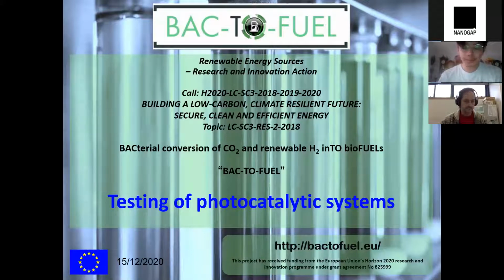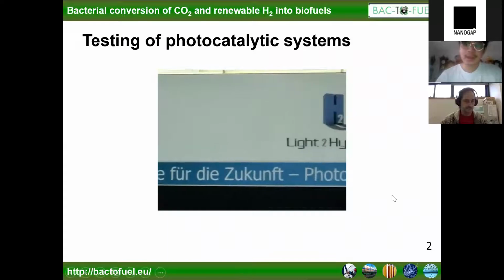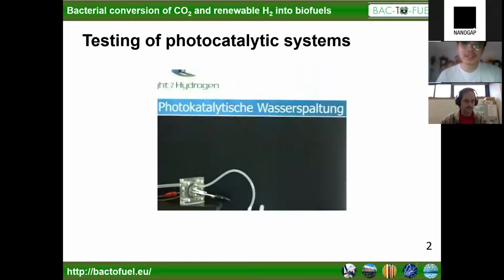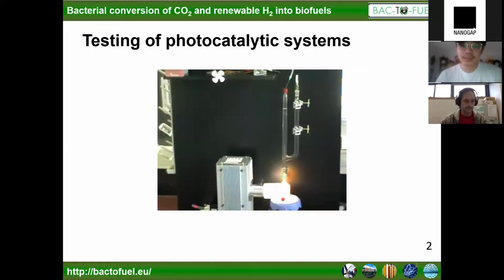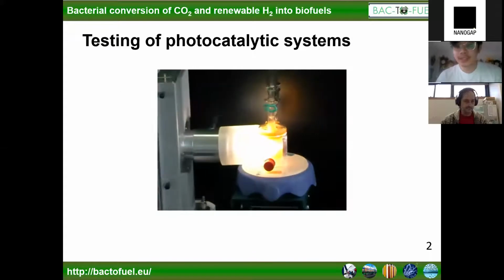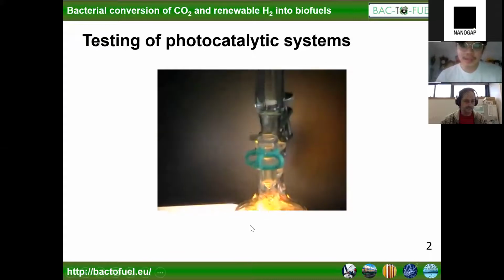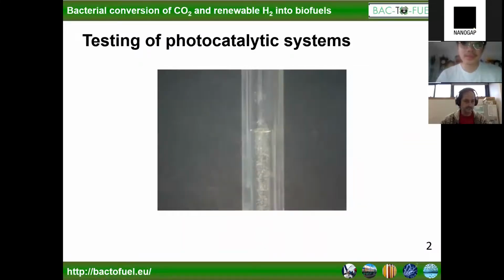As an introduction, I am only going to show you a video. It's a video a colleague of mine recorded several years ago. Here you can see a photocatalytic reactor setup. The photocatalytic system here contains carbon nitride. As you can see, we also used a sacrificial agent, and with incident light, it produces hydrogen. But as you can see here, there was a first thing you should avoid if you do experiments with photocatalysts.